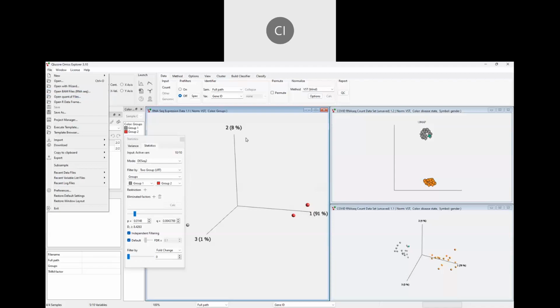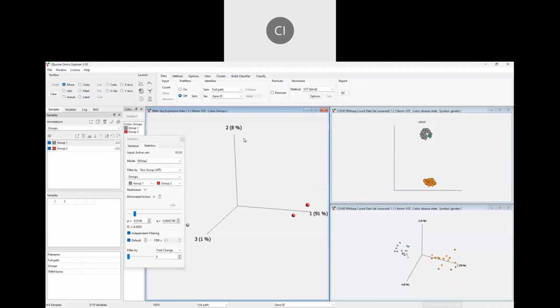At the end here, I just would like to mention also that if you work with a new functionality, there is some information available in the videos and so on that you can have a look at. And there is also the help that's available here with the new functionality, and the COVID dataset. If you would like to work with that, that's also available under example file. So you don't have to import it like I did, it's already here, and then you can play around with that dataset, which is a raw count dataset. You can directly work with it.